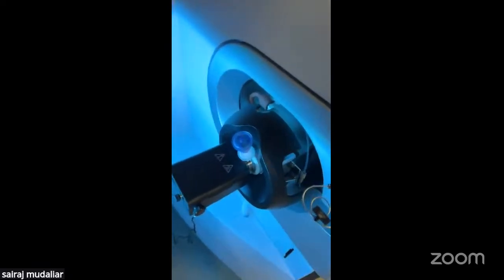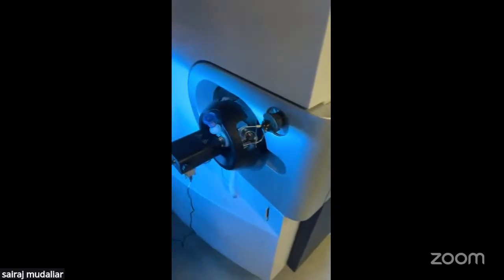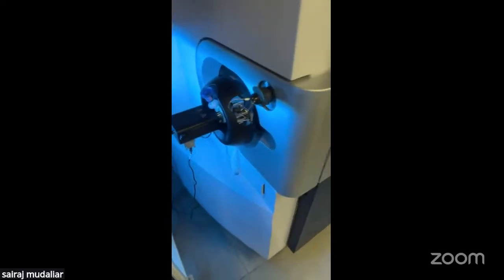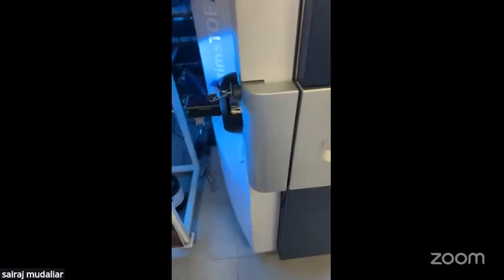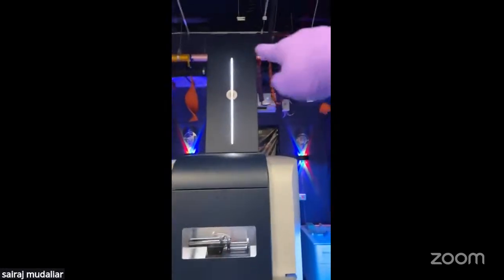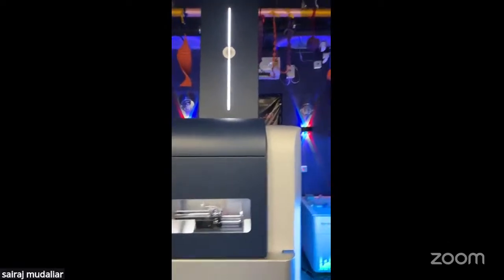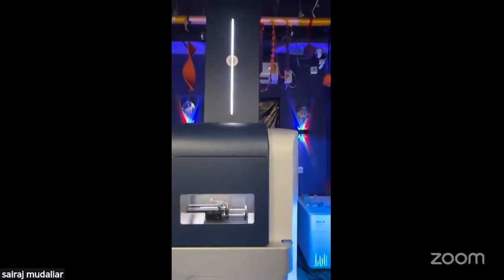And then ions will migrate to the TIMS, where ions will be separated based on the ion mobility, which is decided by the shape and size of the ions and the charge of the ions. Next, after the ion mobility separation, it goes to the PASEF, where parallel accumulation and serial fragmentation occurs. And then it reaches the quadrupole time of flight, where m/z ions are detected.